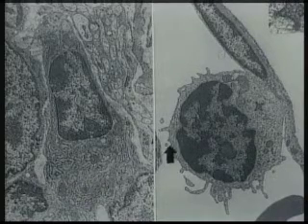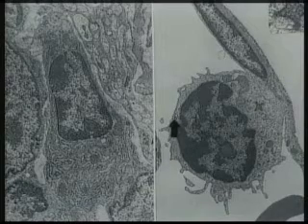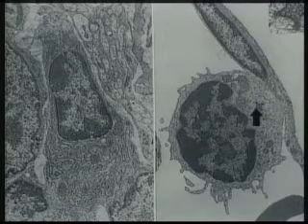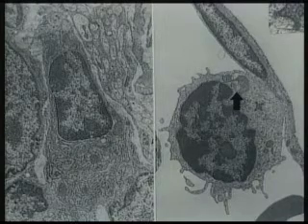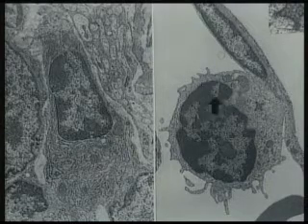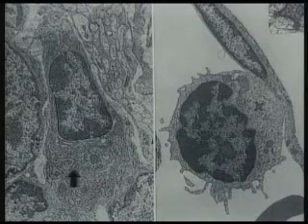This B lymphocyte here has a very limited cytoplasm. You can see a centriole here, a mitochondrion here. Compare that with the cytoplasm of the plasma cell over here. Tremendously well-developed rough endoplasmic reticulum.